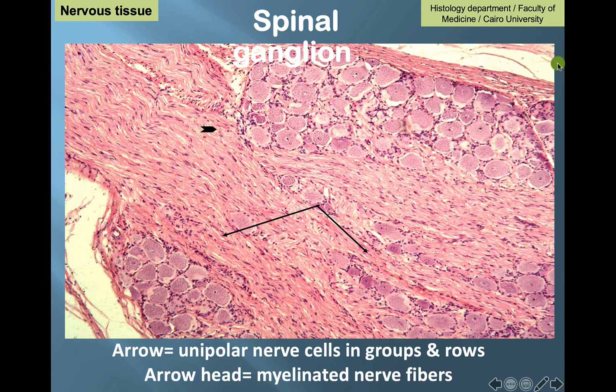Here, this is the spinal ganglia. How in the practical exam can you distinguish the spinal ganglia from the sympathetic ganglia? In the theory, we have 10 differences, but in the practical, we have just 3 very evident differences. These differences are actually SAS. Which is SAS?